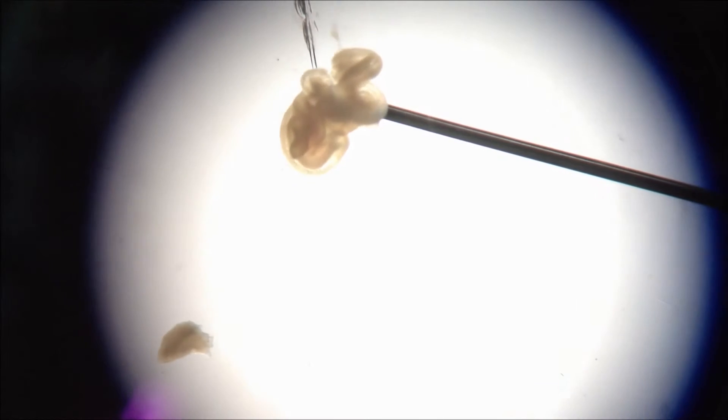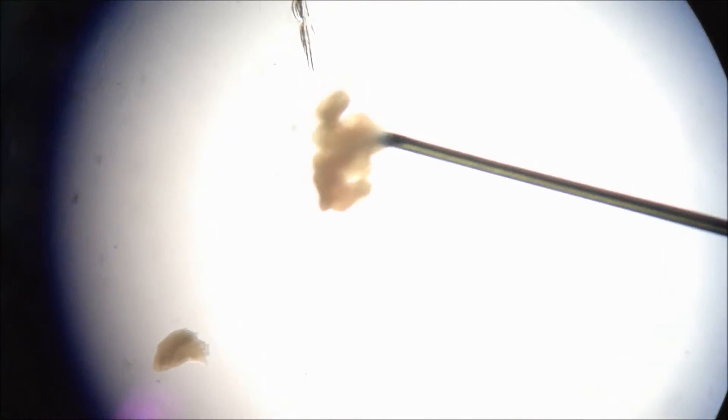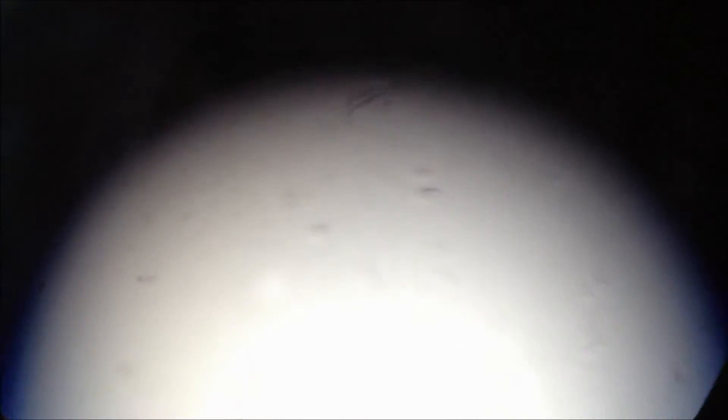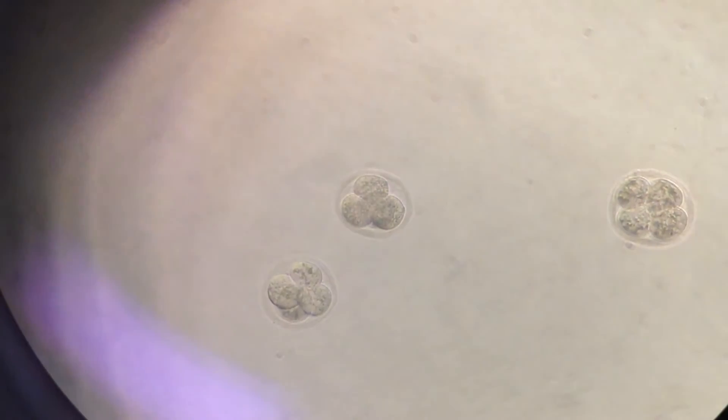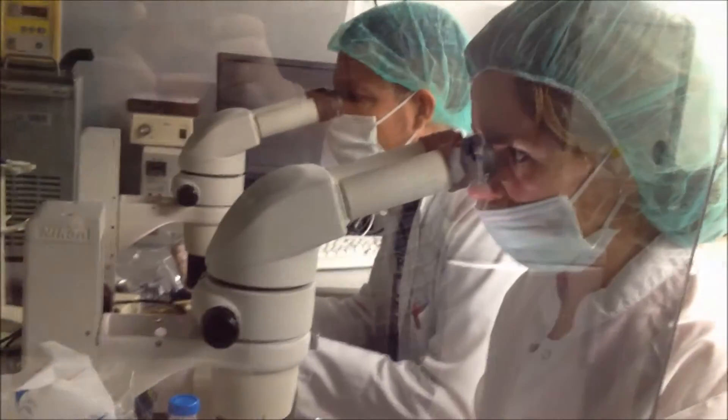The 1.5 day embryos at a 2 to 4 cell stage will be floating in the flush PBS and must be collected. Put the embryos in a culture medium and place in an incubator with 5% carbon dioxide at 37 degrees until Monday.